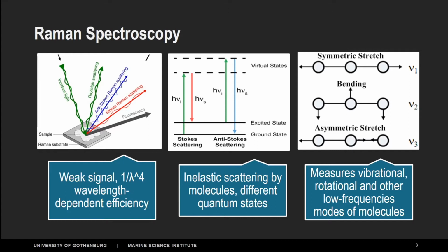So if we send 633, we are going to look into the 100 nanometer difference, so from 640 to 744. So that's what our detector is going to register, because there is the signature of our chemical compounds that we want to analyze. And in the third picture there, you see actually what's happening with the molecules. So they start vibrating and you have a stretch, you have a bending. So for me, it's like a dance of these molecules when they get the energy from the laser.